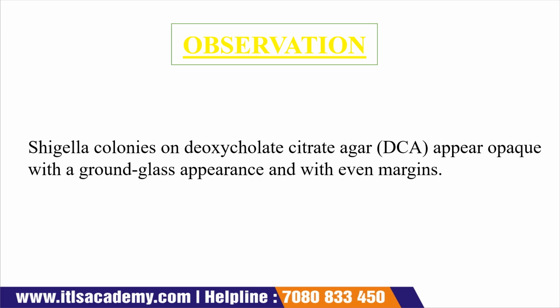If there are Shigella colonies present on deoxycholate citrate agar, then they will appear opaque with a ground glass appearance with an even margin.